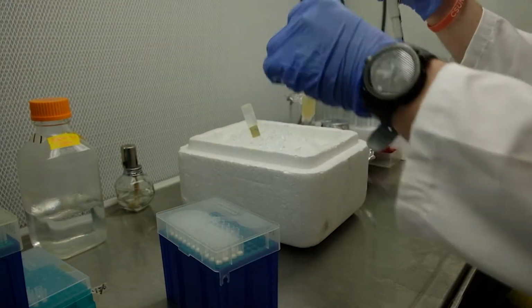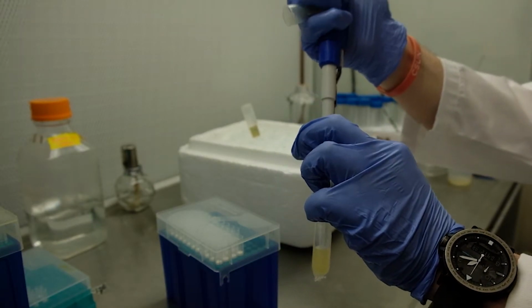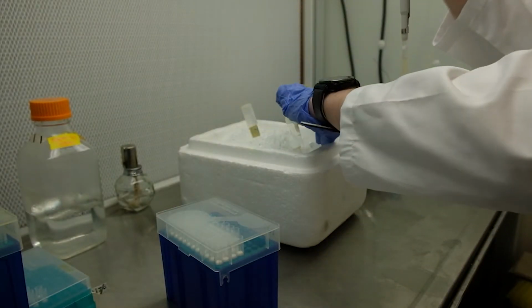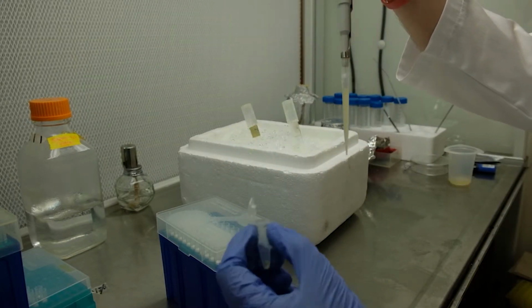Now, again, fill your microfuge tubes with corresponding cultures. Together with centrifugation and the step where you discard the supernatant, this process will be repeated until you're out of culture. The purpose of this cycle is to collect all the bacteria you have in the culture as a pellet on the bottom of the tube.